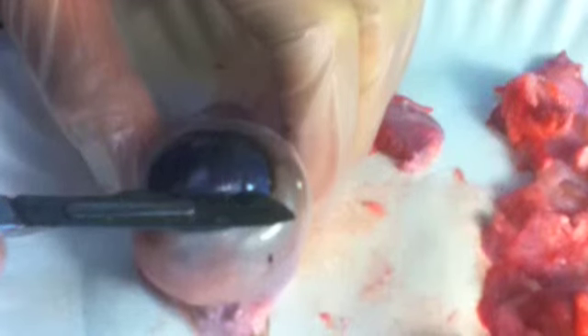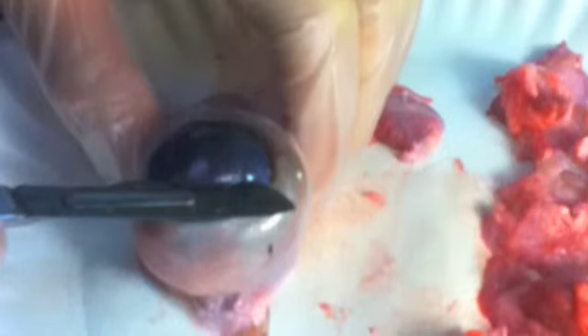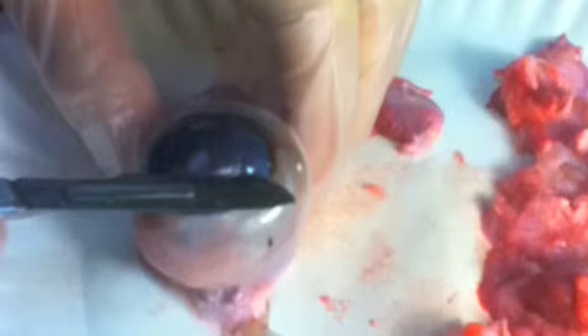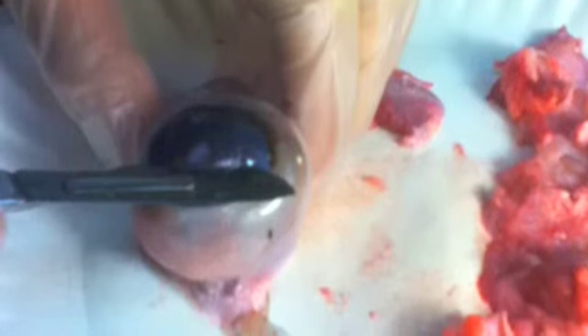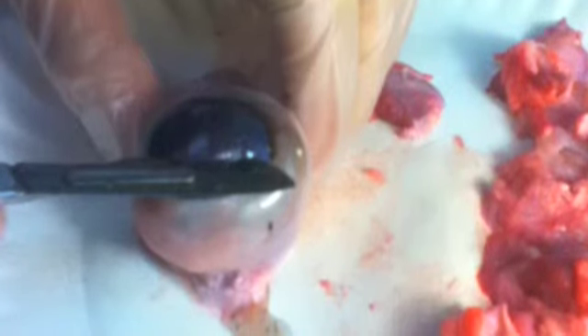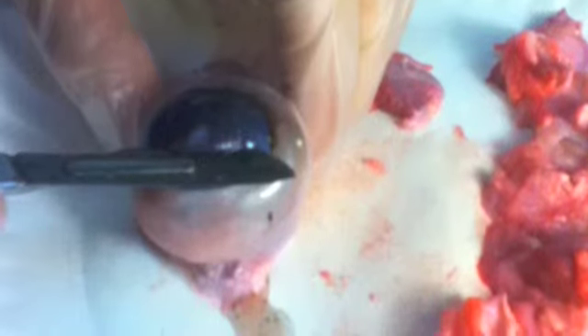Now we begin the dissection. We start by cutting through the cornea, but be careful not to cut all the way if you want to preserve the lens. You'll know you've cut through when the aqueous humor, which is the jelly-like filling in the anterior cavity of the eye, shoots out. Its purpose is to keep the eye shape, apply pressure, and provide nutrition to the ocular tissues.